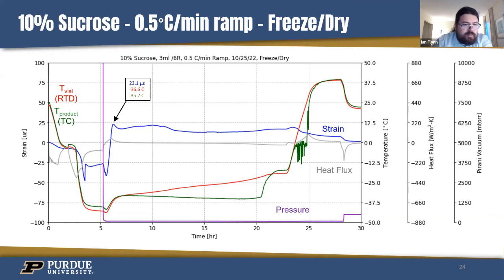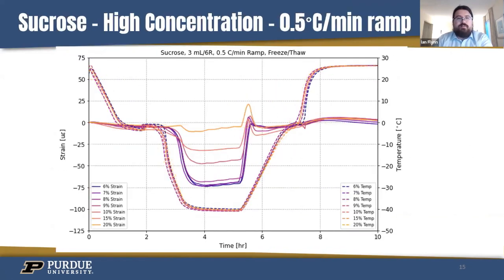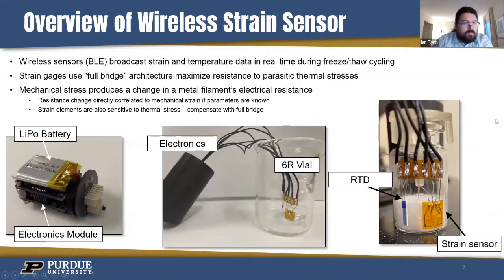You should be repeating measurements with the same solution. What is the vial to vial variability? There is some. Most of these experiments have been done with the exact same vial, just because of limited resources. Right here is one of the vials we've used. We've had two of these vials that we've really tested. There is some variation just because of how these were done. They're just placed on manually, so the location of the sensor very much matters. We have not really tested vial to vial comparisons with our new, more accurate way of placing these on. So I apologize, we don't really have vial to vial variability at the moment.